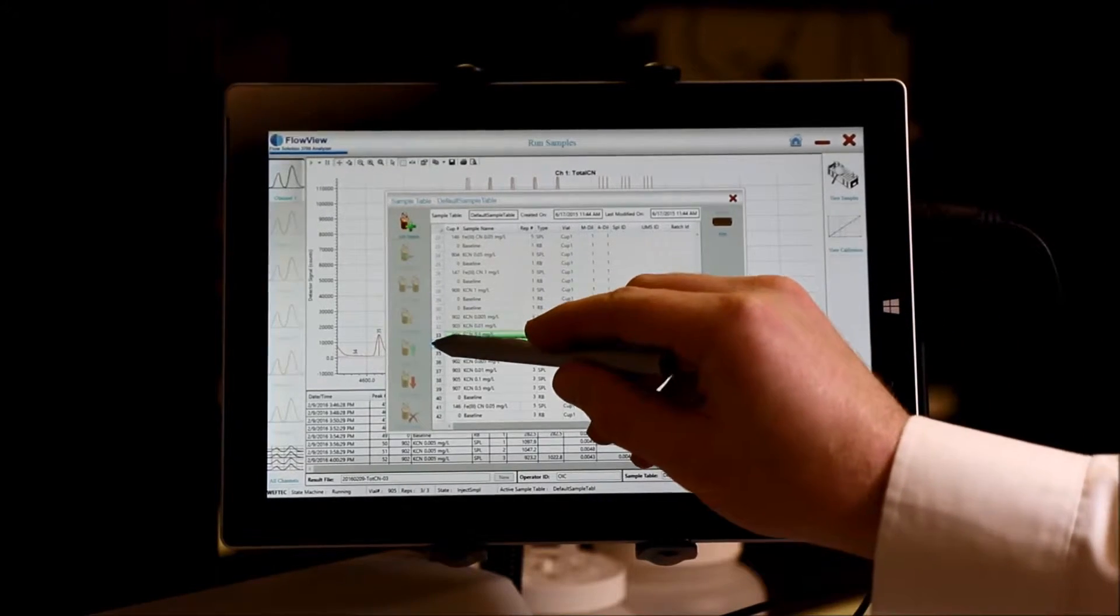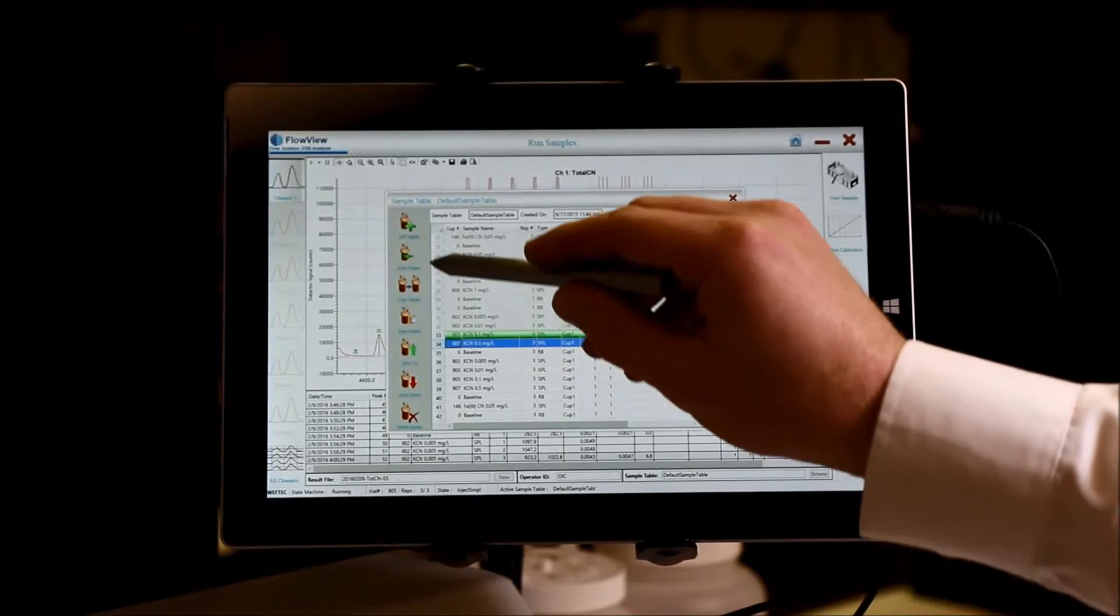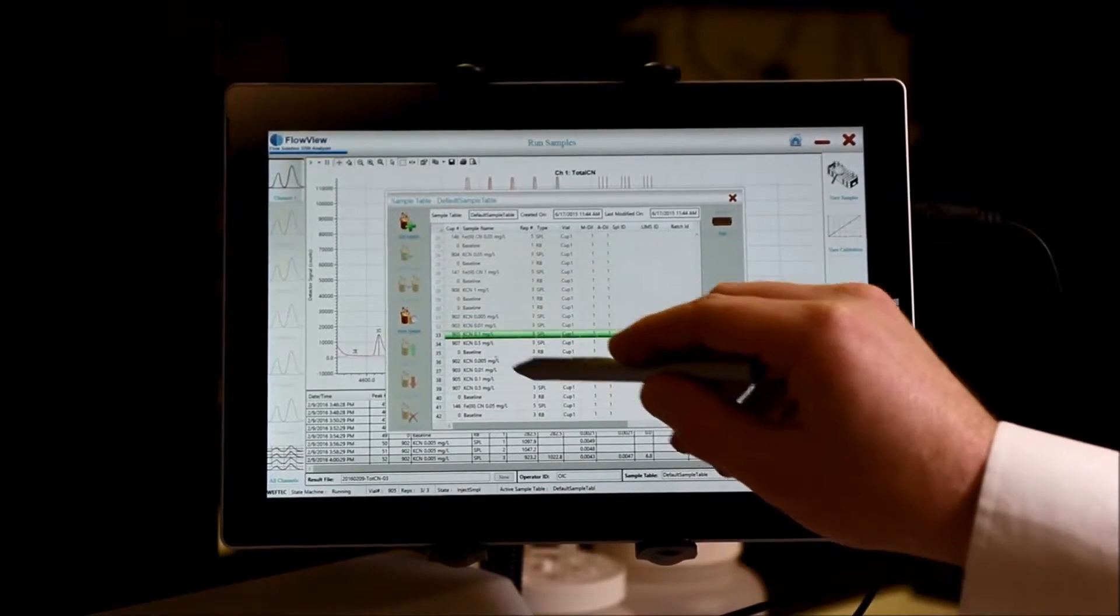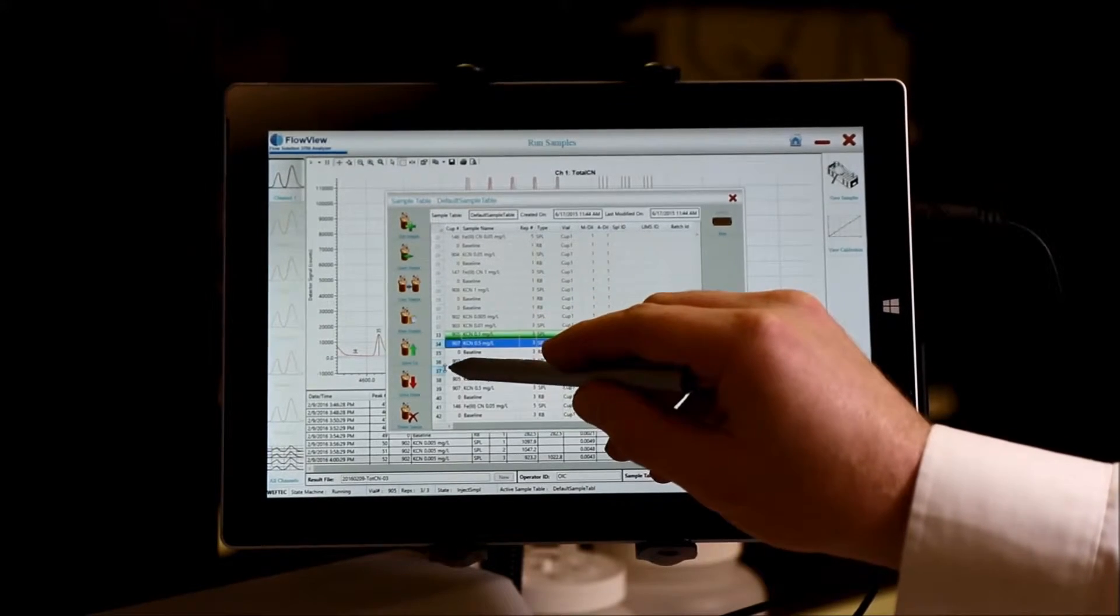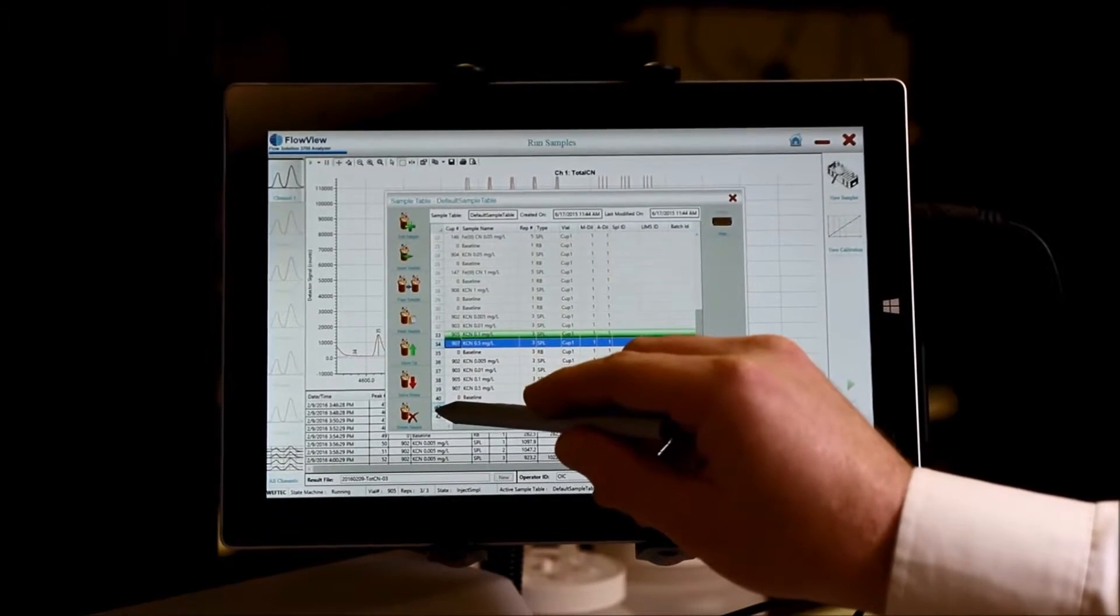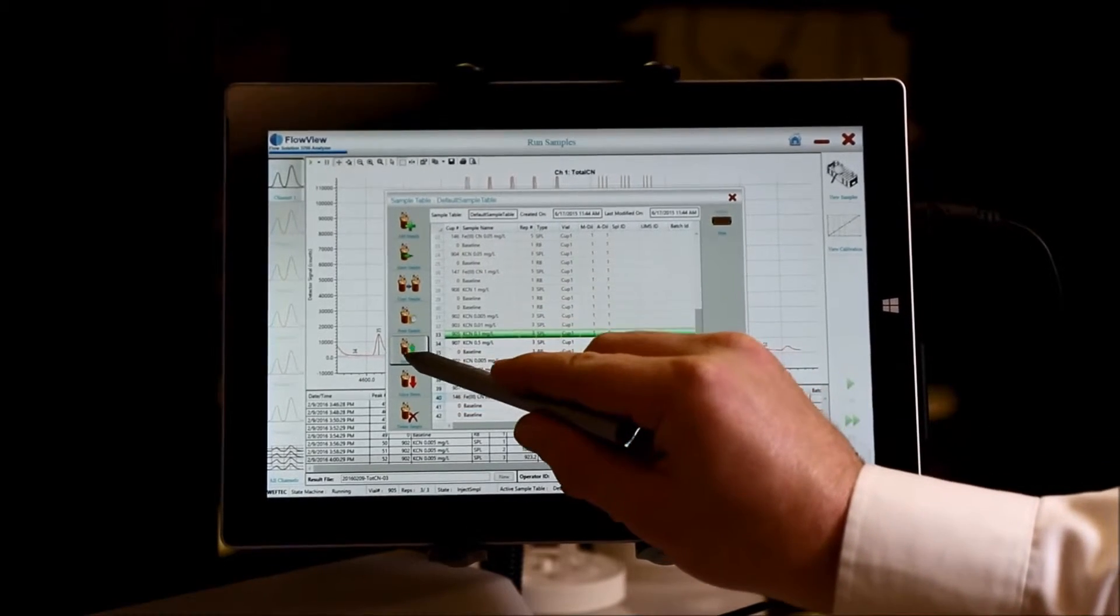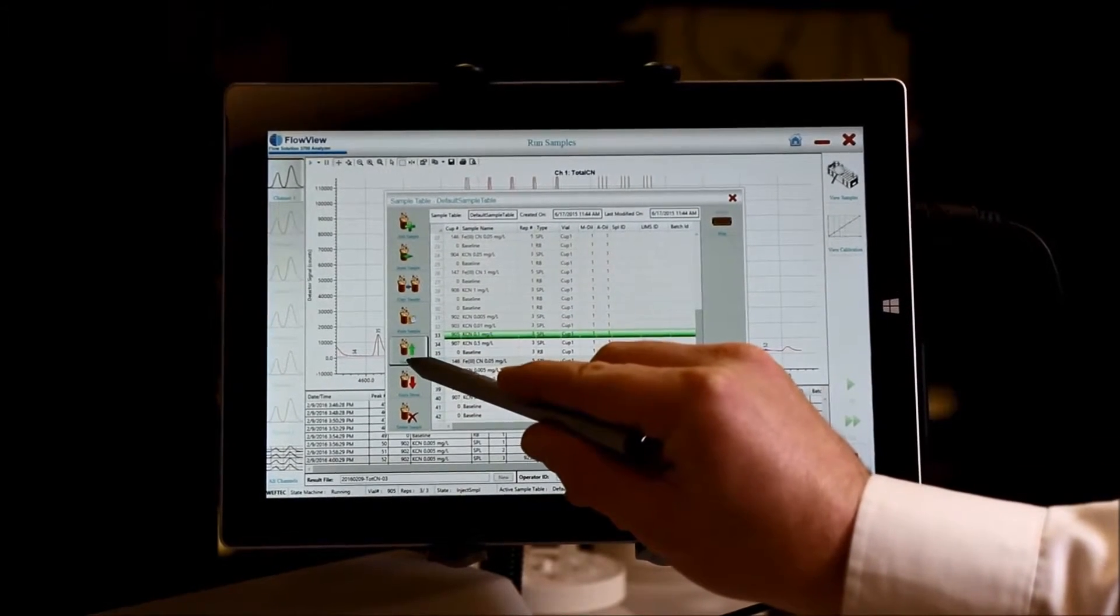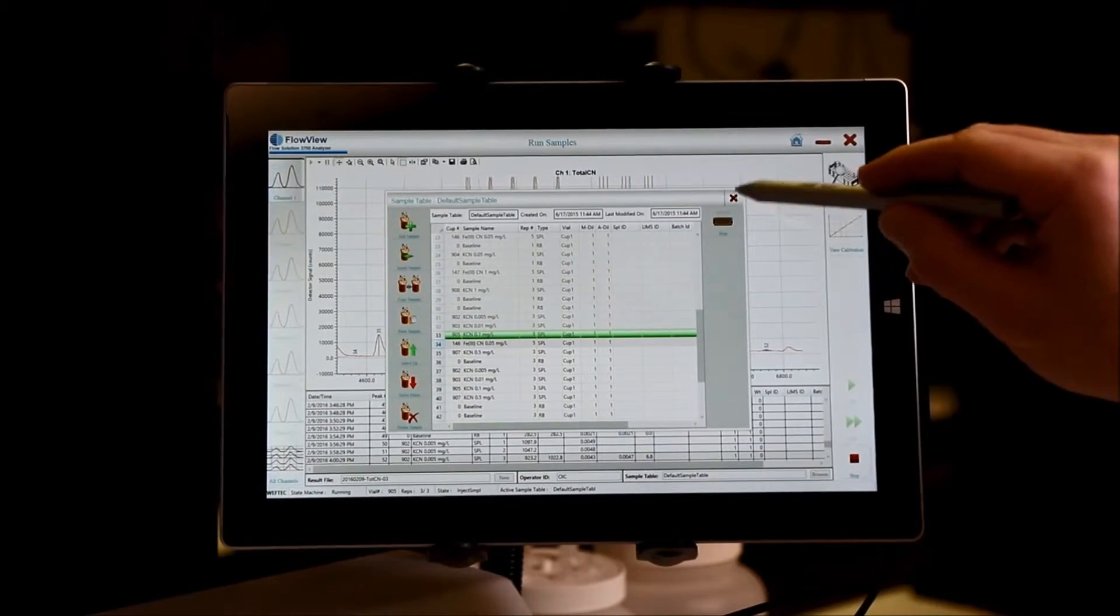So we could certainly have a sample come into the lab and say we need to run the sample next. Or perhaps maybe this sample needs to be the next sample that is run. Now that will be the next sample that is run.